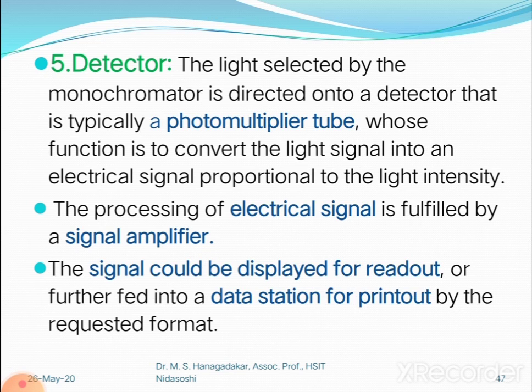The signal can be displayed on the readout system, or it is further fed into a data station for a printout as per our requirement. Finally, we can give the report by the detector regarding the sample information.